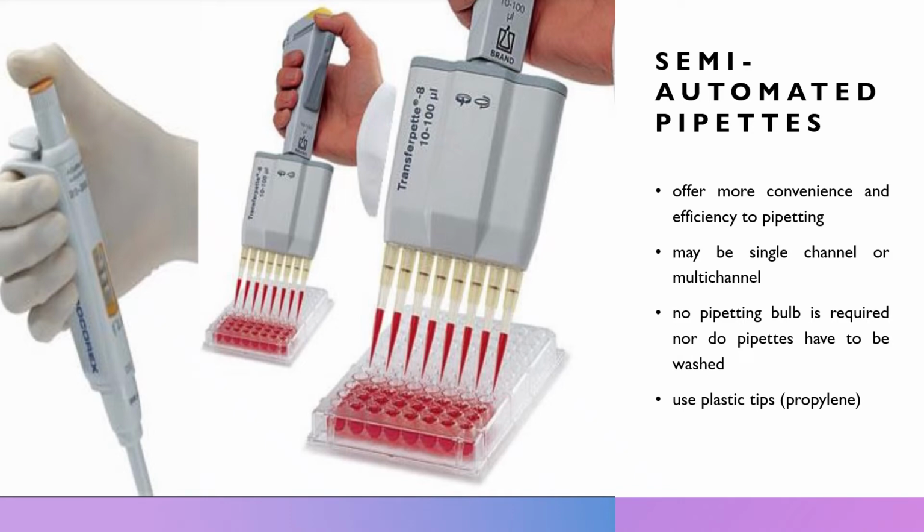The one that is used in the laboratory, we use the semi-automatic or semi-automated pipettes. The automatic and semi-automatic pipettes have many advantages, including safety, stability, ease of use, increased precision, the ability to save time, and less cleaning required as a result of the contaminated portions of the pipette.